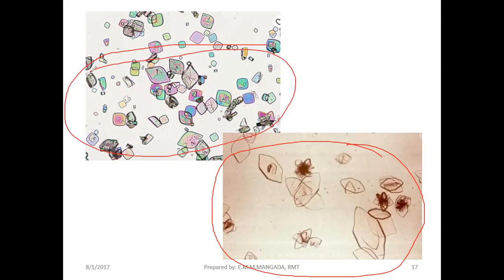Okay? So guys, I hope you appreciate or can see the difference between the two. These are actually uric acid crystals from the urine of a patient. Under your bright field microscope, the crystals appear this simple, right? We have that hexagonal structure, some needle-like sheets. It is just brown and doesn't have any color yet.